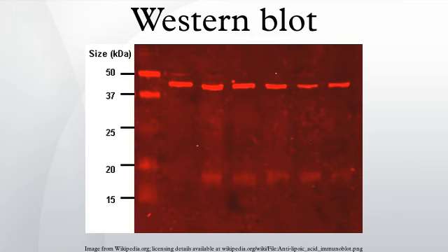After blocking, a dilute solution of primary antibody is incubated with the membrane under gentle agitation. Typically, the solution is composed of buffered saline solution with a small percentage of detergent, and sometimes with powdered milk or BSA. The antibody solution and the membrane can be sealed and incubated together for anywhere from 30 minutes to overnight. It can also be incubated at different temperatures, with higher temperatures being associated with more binding, both specific and non-specific.